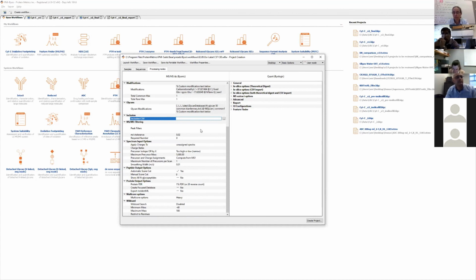If you're specifically after just glycan identifications, you may want to apply peak filters and run a wildcard search on glycans so that you can identify anything that is not in this database, but again, without expanding the search space indefinitely, or to infinity. But for this experiment, we don't change that. Nothing else here, we don't change anything else.